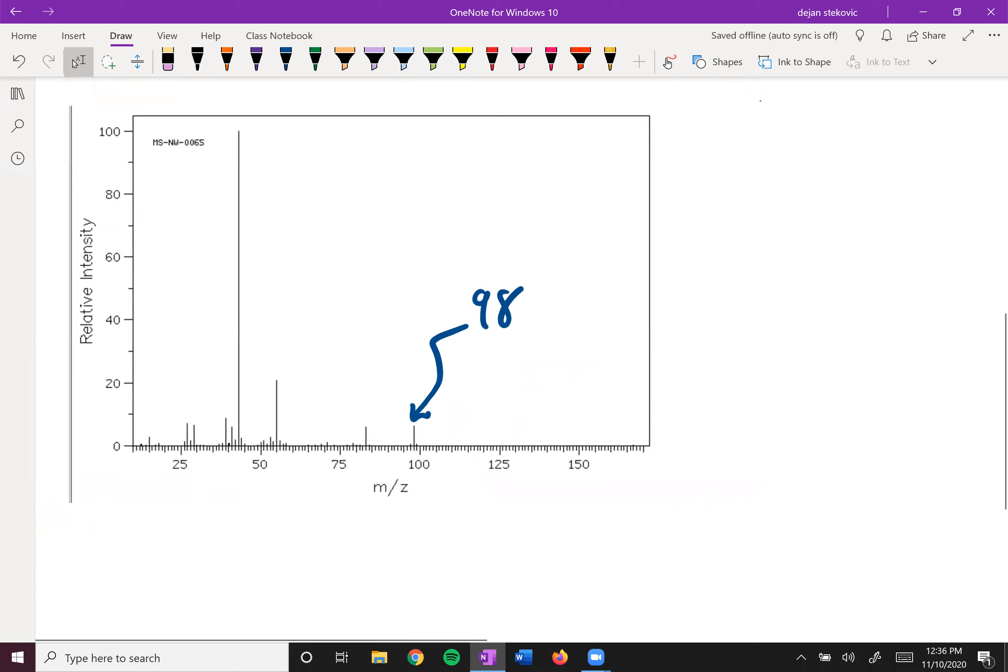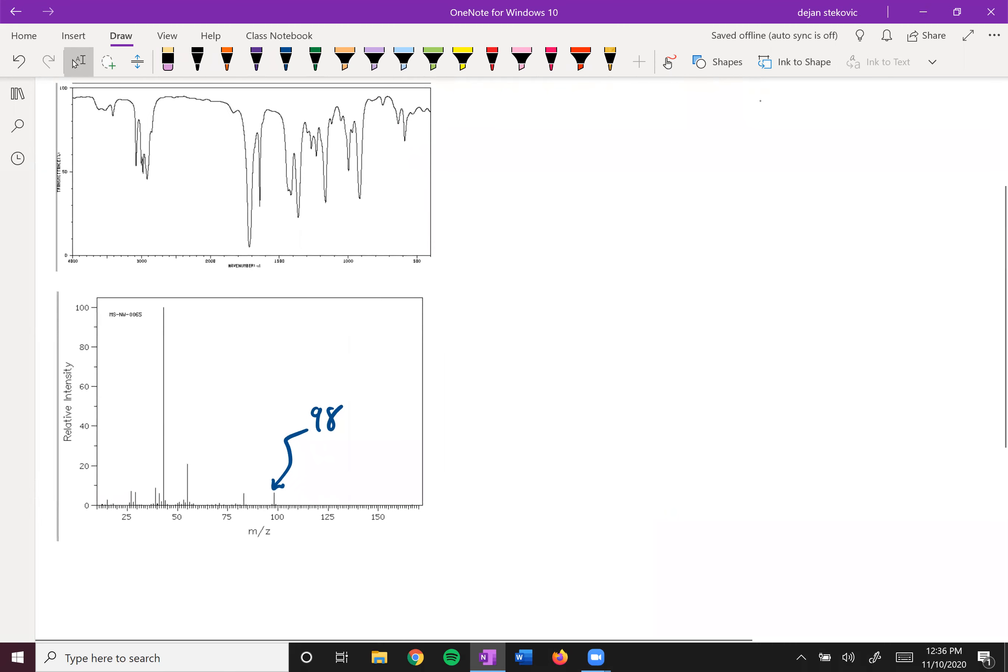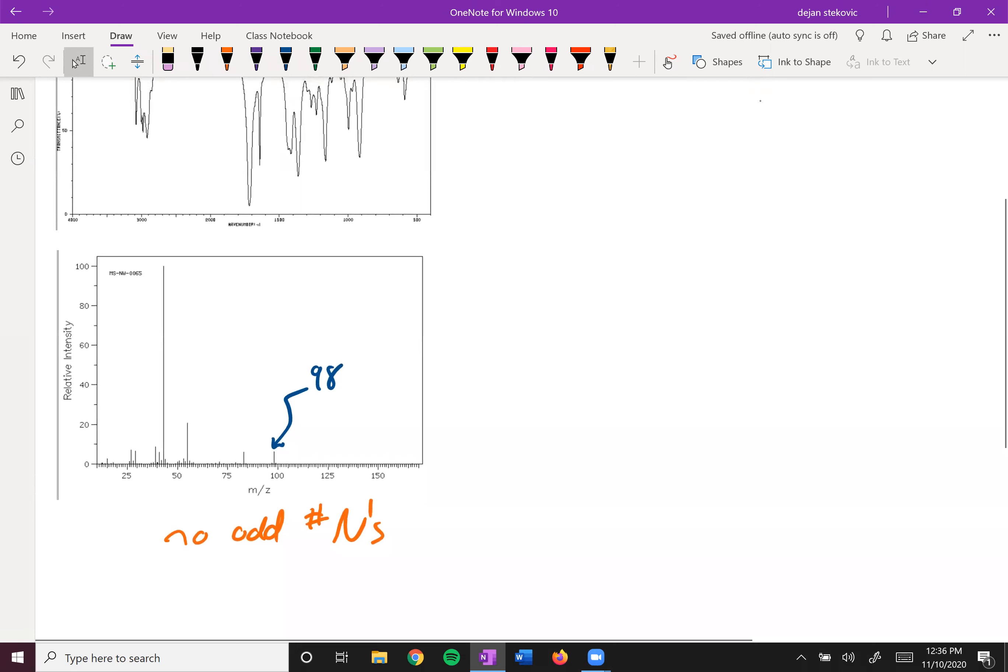Think about what that tells you. It's an even number, so no odd number of nitrogens. It does not have that three to one size peak for the chlorine with the M plus two peak, and it doesn't have two evenly sized peaks two mass units apart, so there's no bromine either. That's the information we can pull from there.